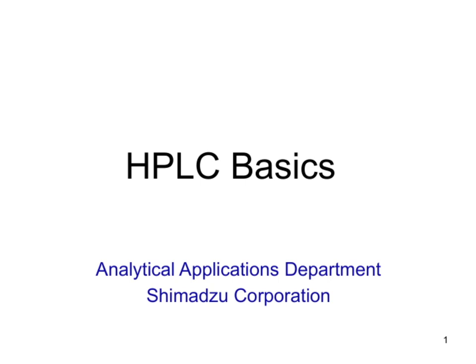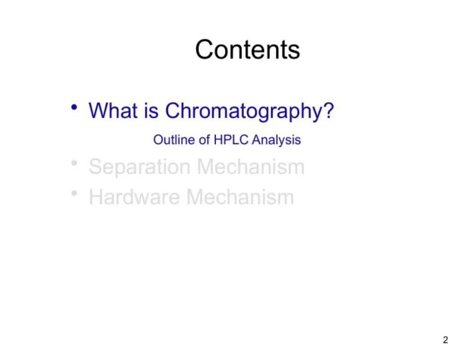Let's get started. Let's start by understanding what chromatography is. Essentially, it's a powerful technique used to separate components within a mixture. This separation allows us to analyze and identify individual substances more effectively.